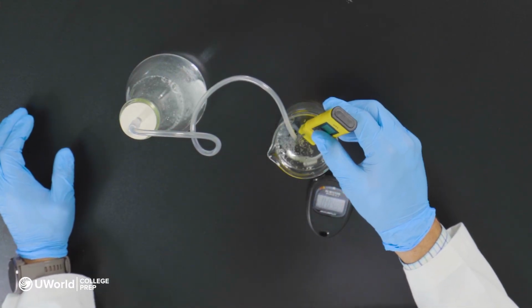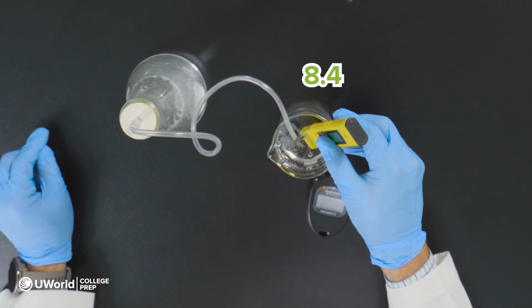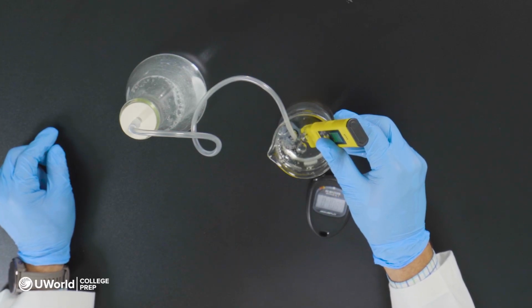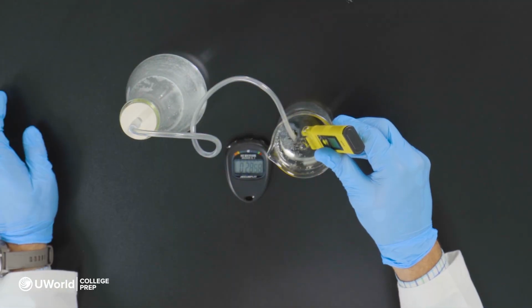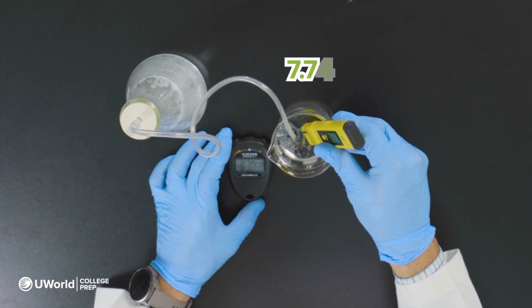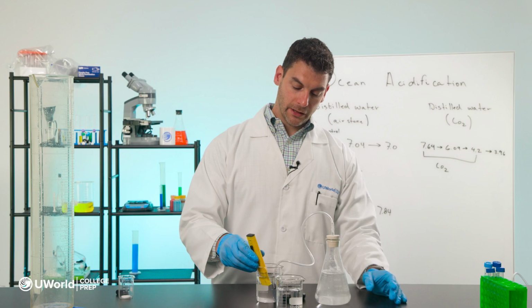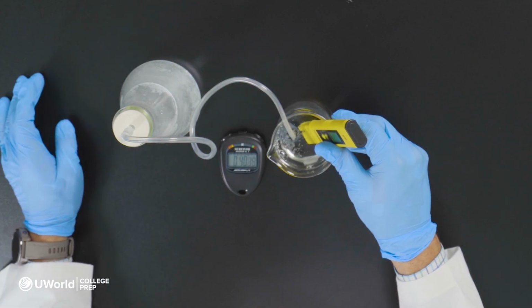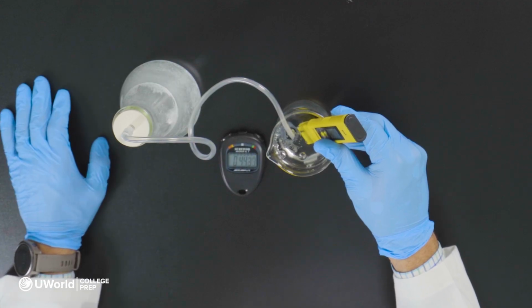So we started with a pH of about 8.4, excuse me, and it is quickly dropping. After 30 seconds, we're about 7.78. So it's dropping, but it's not dropping as quickly as our distilled water, because remember, our ocean water has a bunch of dissolved salts in it, which buffer the change in CO2.